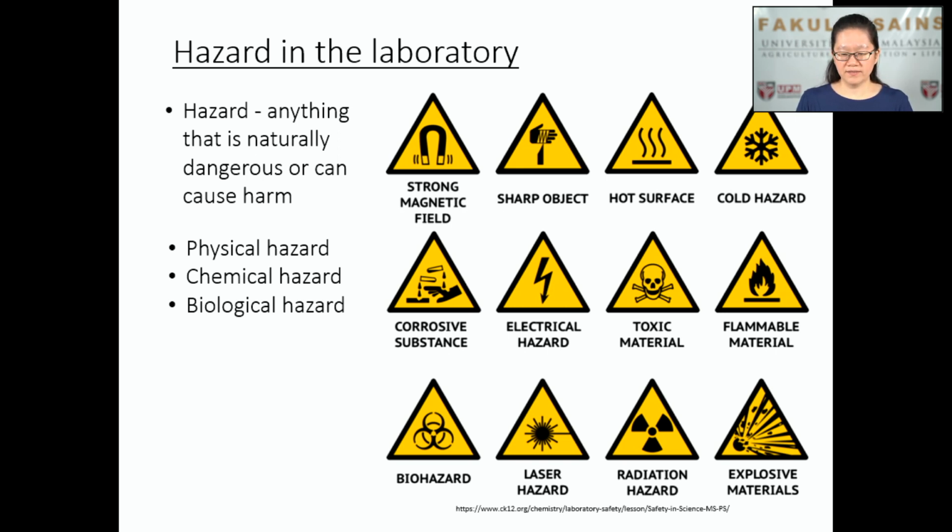Examples of physical hazards include electrical hazards, laser and cold hazard, and sharp objects. Chemical hazards include explosive materials, corrosive substances, and also flammable materials. As for biological hazards, they include infectious agents and also infected tissues or organs. Today, we are going to focus on biohazards, which is closely related to biosafety.